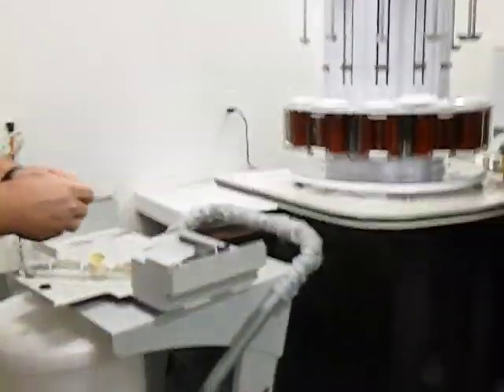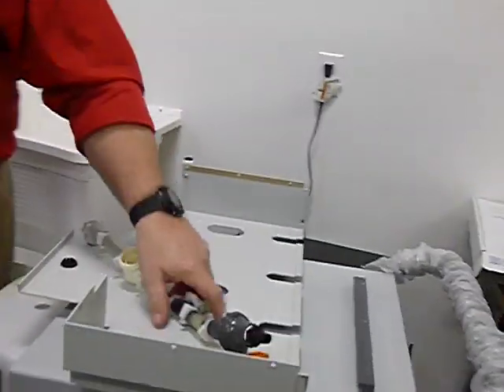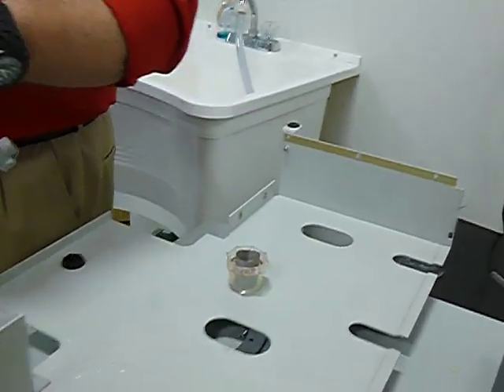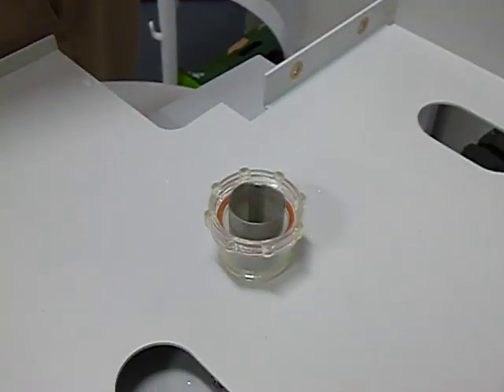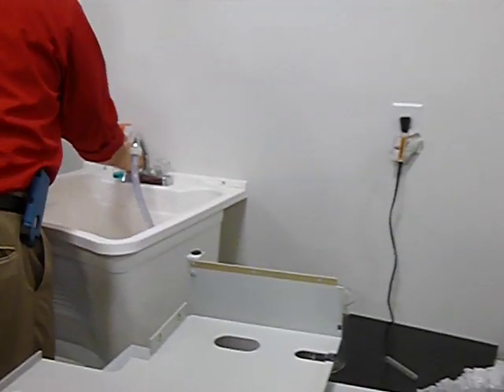Keep it. I once cleaned the pump on the Varian, and it was like, I don't know what formed inside. It was not like algae, but something else. It was like a paper towel. Yeah? Yeah, so it blocked the pump completely. Wow. Maybe somebody dropped something inside of it. No, it has grown inside.